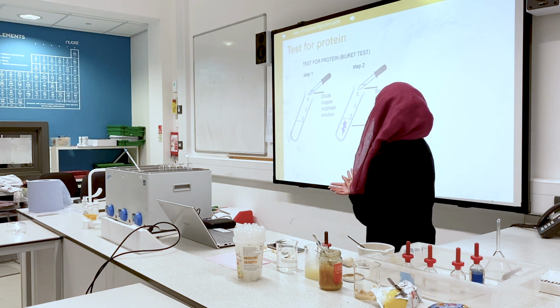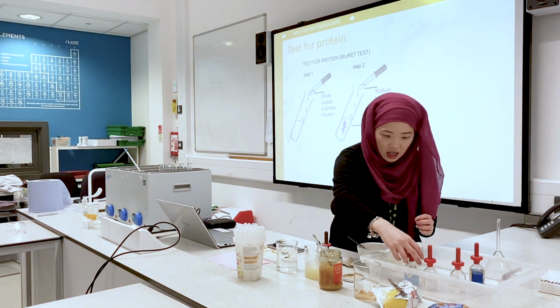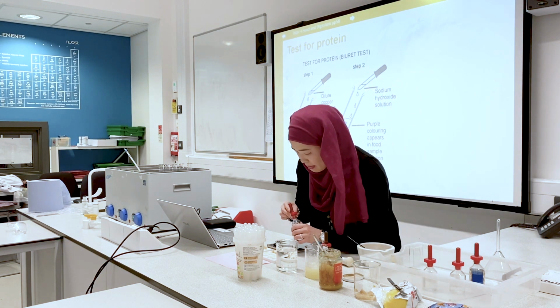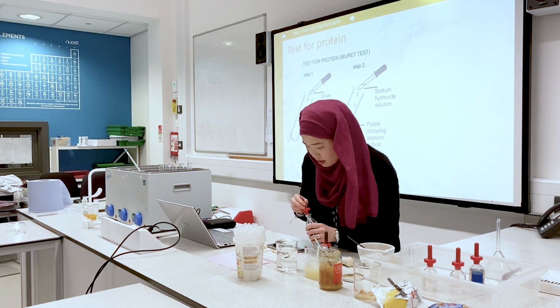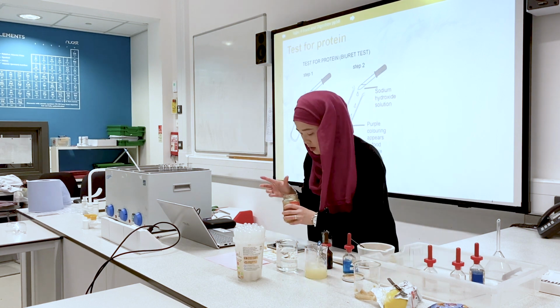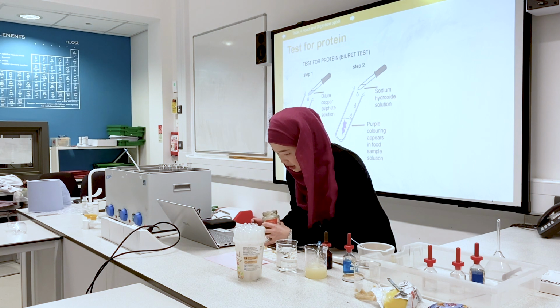I'm now going to test for protein, and I've got Biuret solution. Honey.